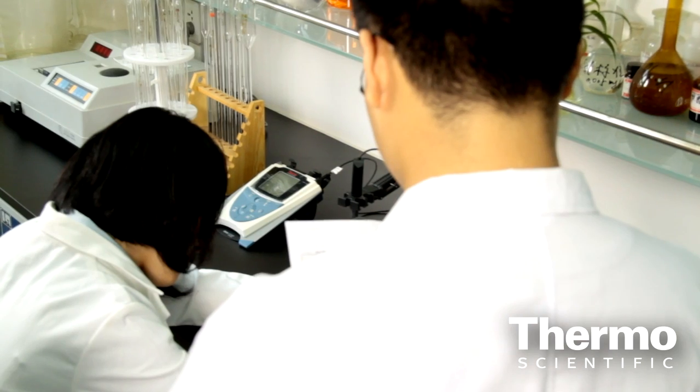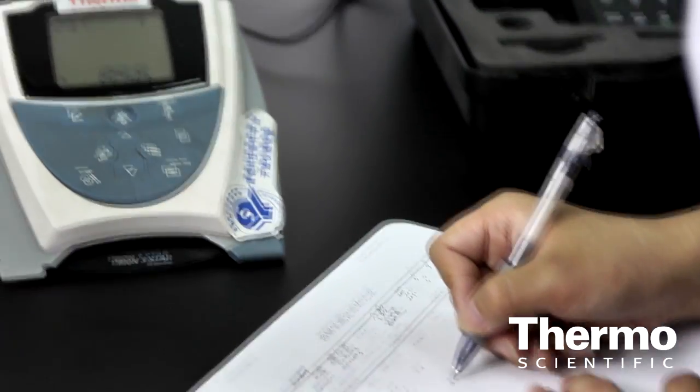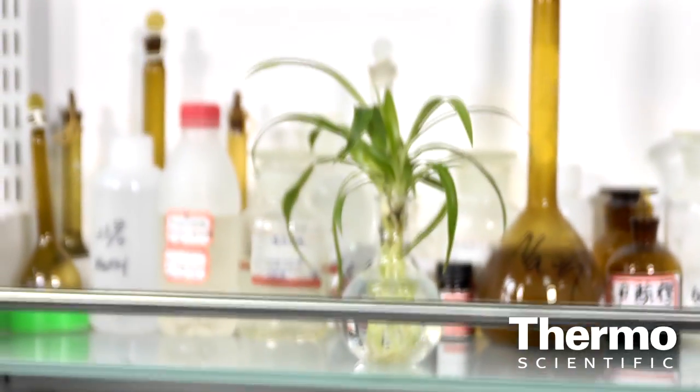For wastewater analysis, we apply Thermoscientific analytical instruments for inspection of ammonia, nitrogen, COD, BOD, total phosphorus, total nitrogen, turbidity, pH, conductivity, and dissolved oxygen.